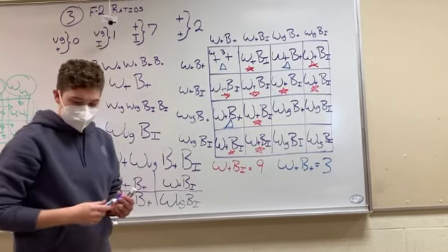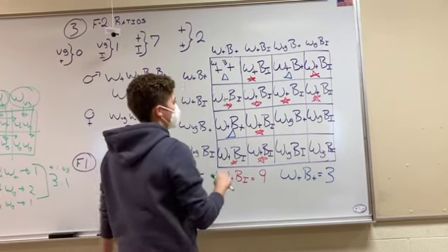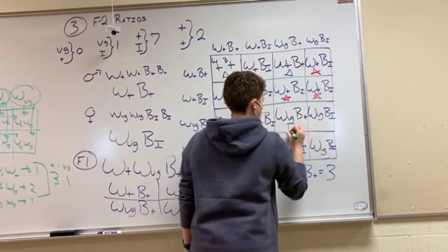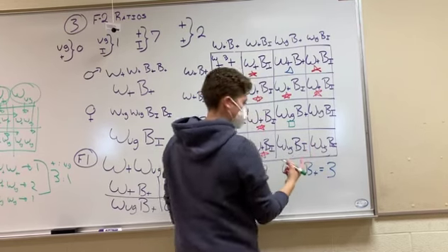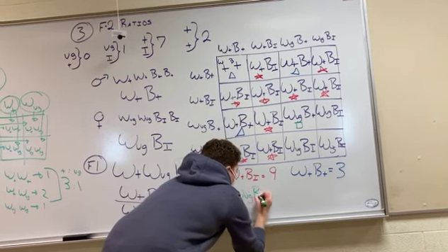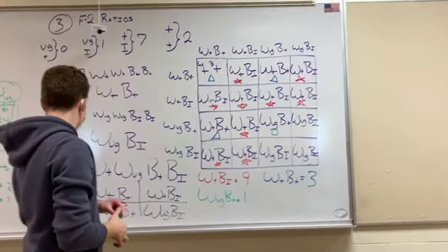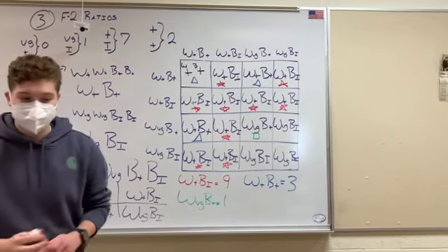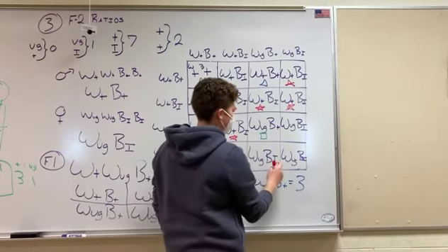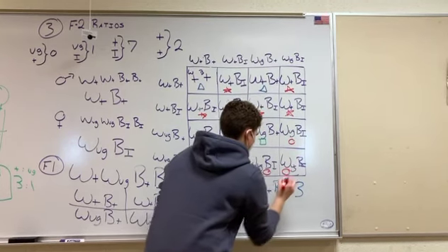All right, 3 of those. Now, what have we got left? We've got vestigial and wild type. Just the one. That's it. And last but not least, let me spread back again in this corner. And last one, we've got our vestigial and our yellow bodies. Let's see, circles. 3 of those.